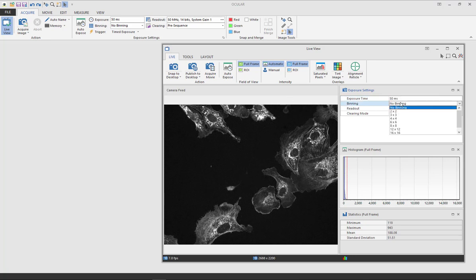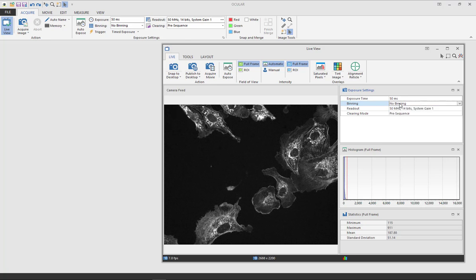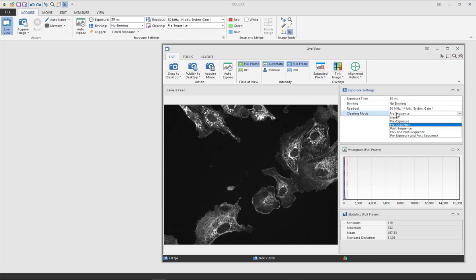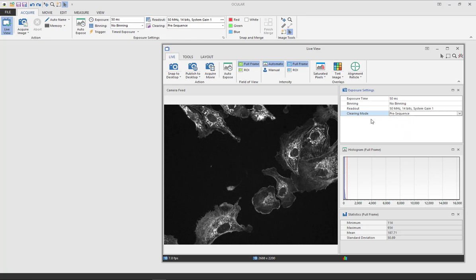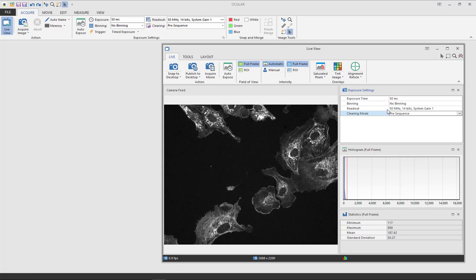Binning will allow you to increase your pixel size which then increases your camera sensitivity and speed. Ensure your clearing mode is set to pre-sequence and that the readout is 50 MHz. Anything lower than this will suggest that you're using a USB 2 port instead of USB 3.